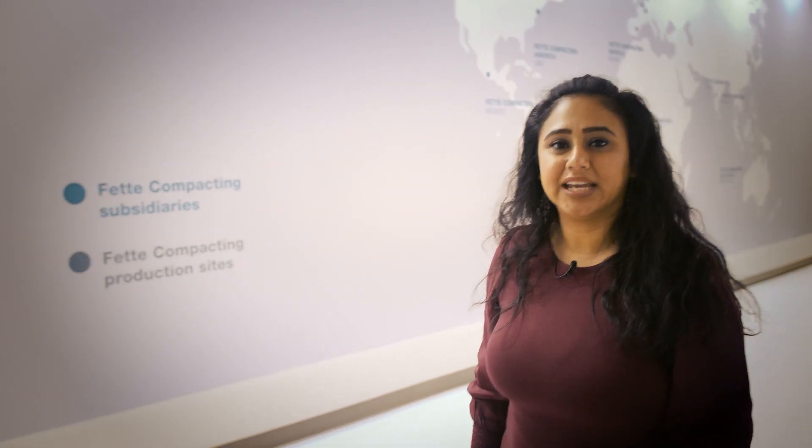Hi, please enjoy this short video on Fette Compacting's Punch Tightness Monitoring.